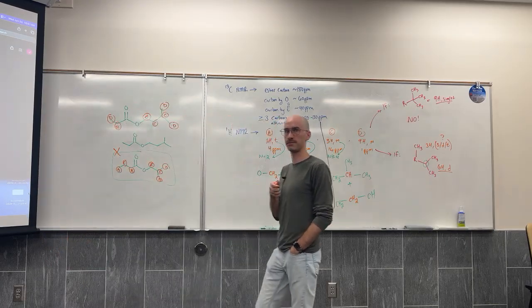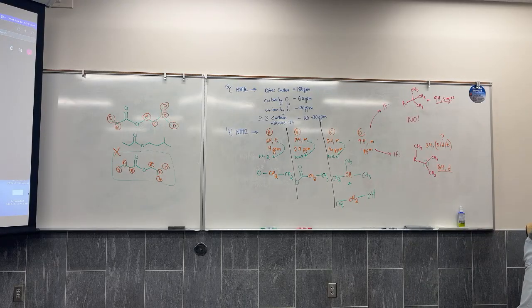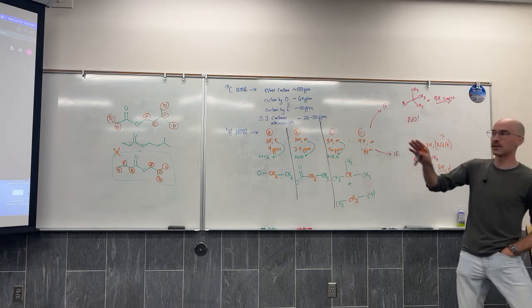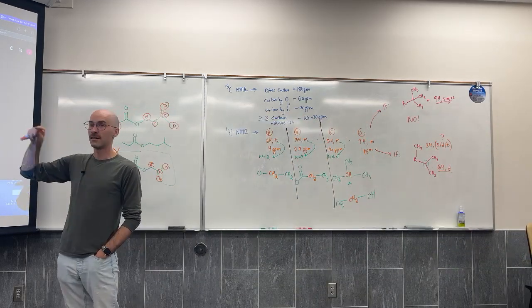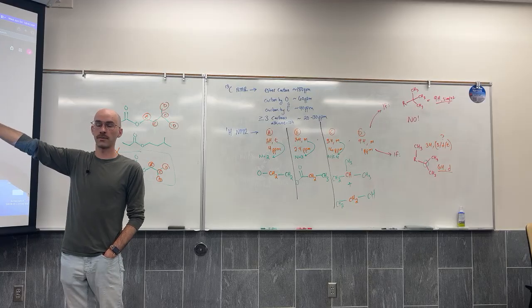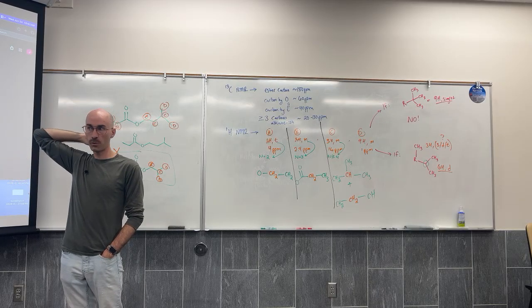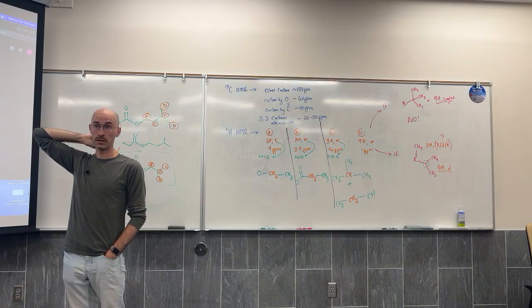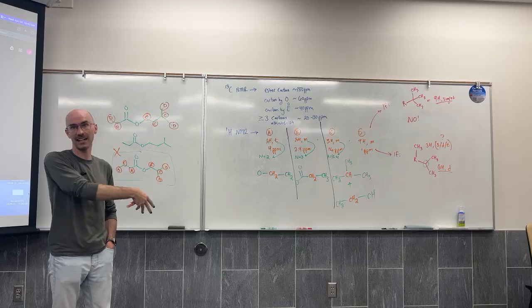You agree with that, Gavin? Yeah. So when I look at this, that's why earlier I didn't plug in the number of hydrogens into my search. When I look at this integration, 2H, 2H, 1H, 9H, I would calculate a chemical formula with 14 hydrogens, which would not have been true because the true chemical formula actually has 16 hydrogens.